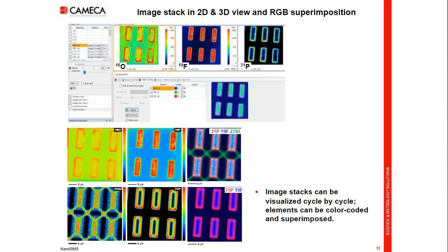All these are major elements, and you see phosphorus as a dopant. You can directly record and superimpose dopant and major elements. And you can also, if you wish, add many cycles to increase the signal-to-noise ratio and improve the detectability of dopants.